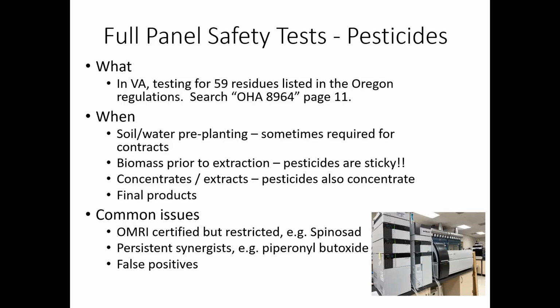And then we've seen some weird hit or miss problems with false positives, not just from our labs, but a couple of others. I think that gets back to needing more industry standards, proven out methods for everybody. You do get some weird background signals sometimes from these plants. The cannabis plant has so much stuff in it, trying to identify this one little thing down to a level of parts per billion can get a little bit difficult, so it can lead to some false positives sometimes. Generally, if you suspect that, the thing to do is to send another sample to a different lab and then compare them. That's the starting point that we've seen be most fruitful in terms of actually moving forward.